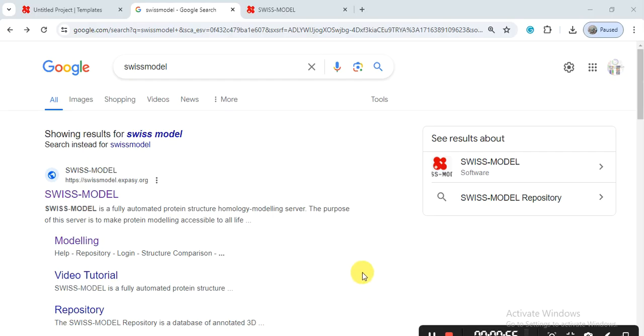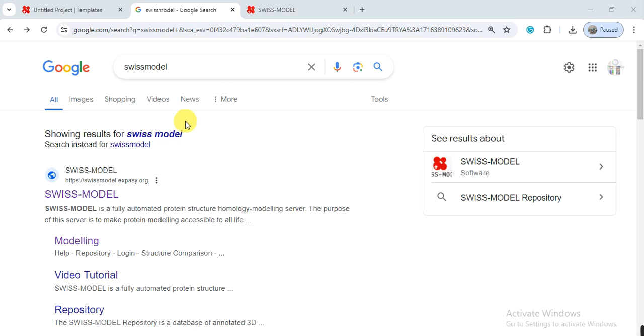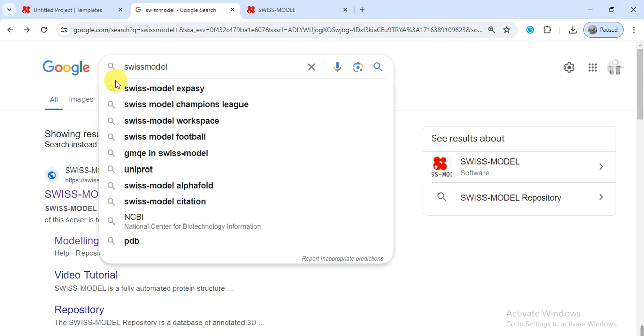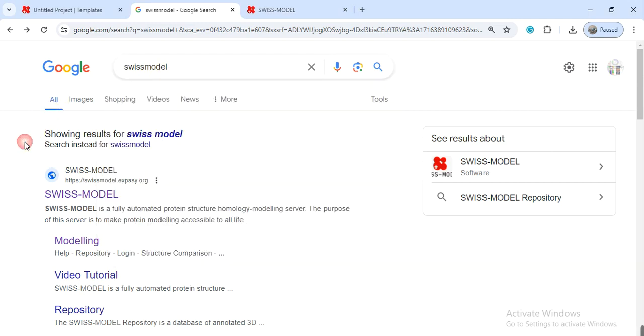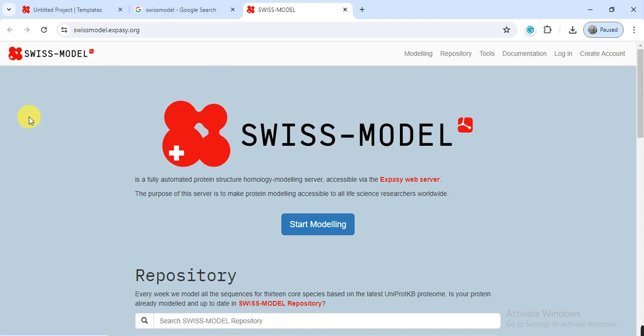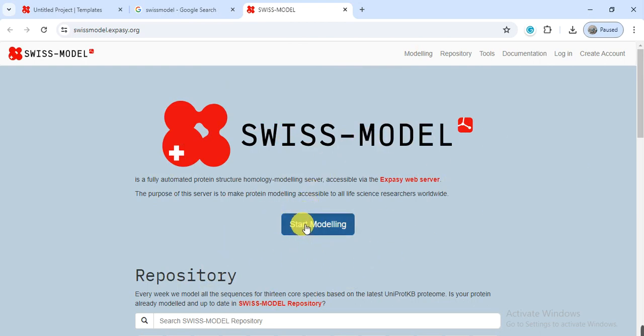First, open Google or any browser that you are using and write in the search engine Swiss model. In Swiss model, you will get this link. This link is also present in the video description so you can also find it there and then you can click on it. By clicking on it, you will come to this link and then you have to click on start modeling.